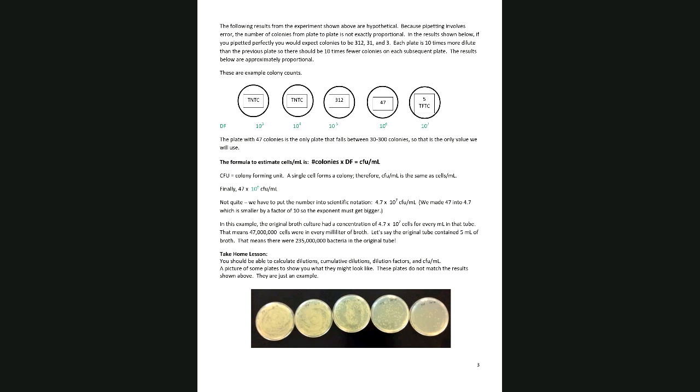So we will talk about the spectrophotometer. There are some problems with using it to measure bacterial growth. The biggest problem is that live cells and dead cells absorb equally. So when you use a spectrophotometer, the absorbance value is giving you the value for both live and dead cells. We only want to know the number of live cells in a culture. And so the web calculator takes that into account when it gives you the estimate of CFUs per milliliter.